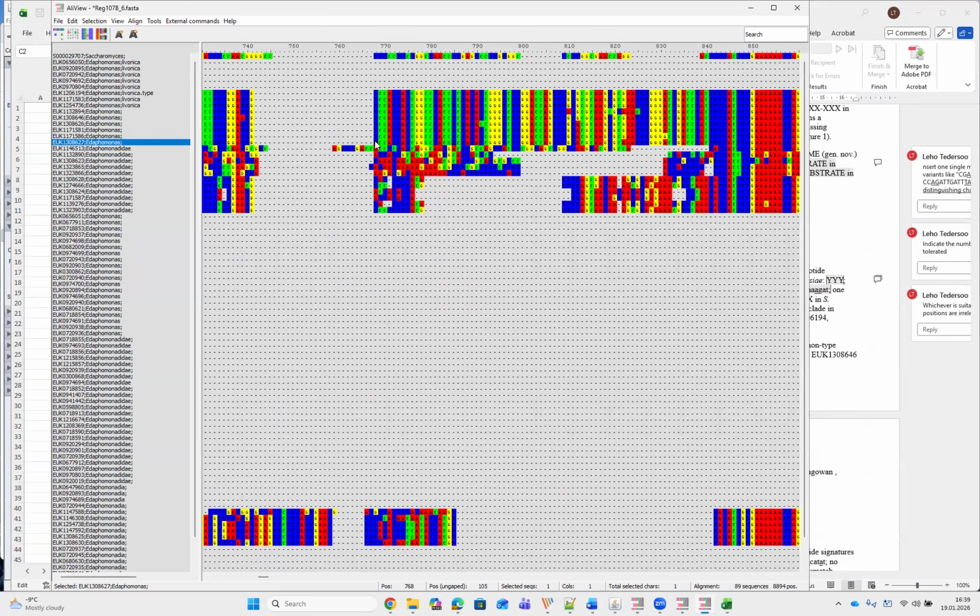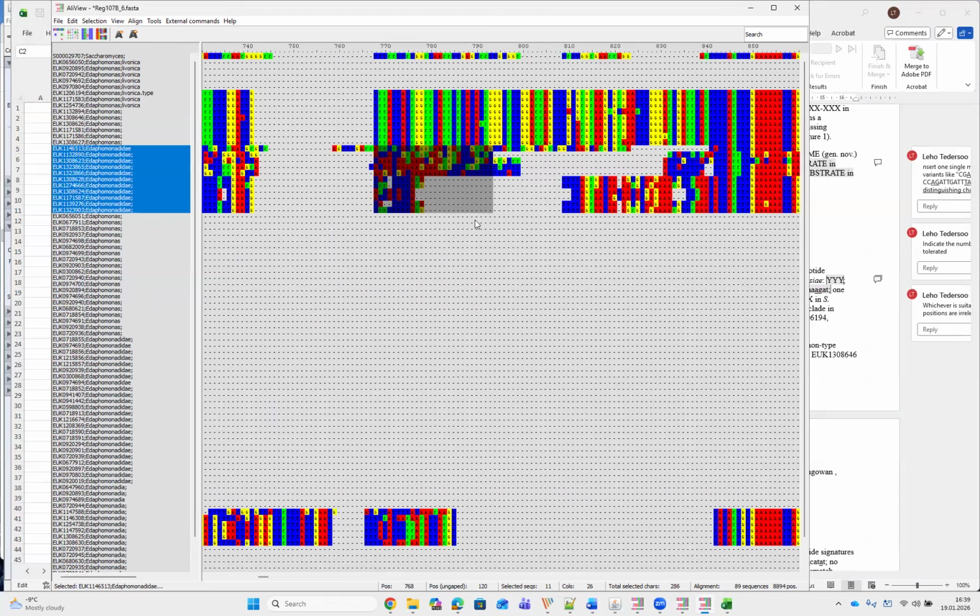So here we see again a similar situation with no internal variability in the genus. So it's actually an excellent region, very difficult to find in SSU in general. And there is actually nothing comparable in other members, other genera of this family. So in a way, it's a perfect microbarcode.